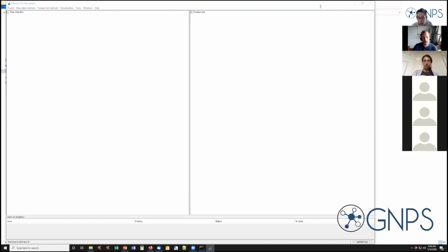All right, cool. So shall we move on with the step-by-step tutorial? Again, what I'm going to do now is jump back and forth between here and the software on my computer. Daniel, can you explain centroid versus profile? Sure, it's one of the questions.